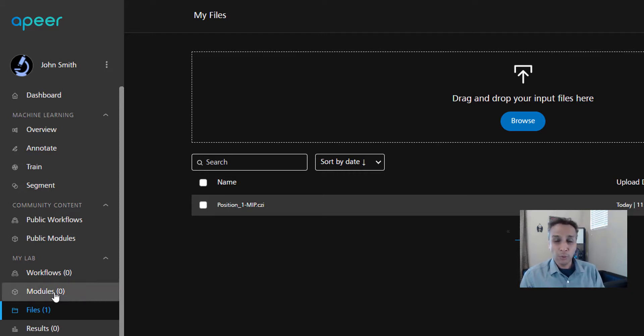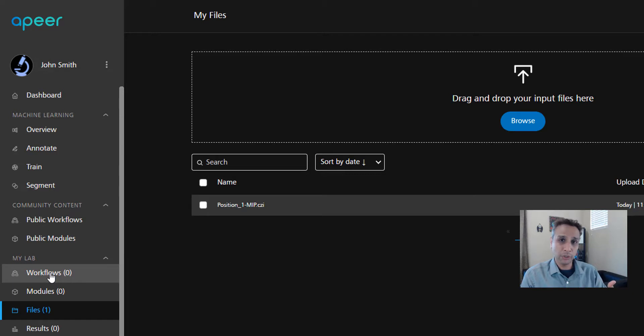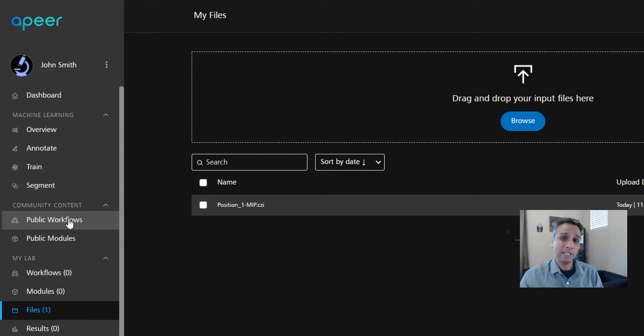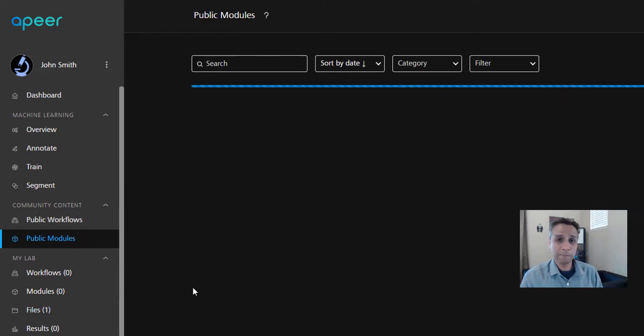I have already uploaded this one image that we're going to use as input for today's workflow. Uploading is straightforward: just go to browse and select the file from your local directory, or drag them here. If you know how to code, you can write your own modules. Otherwise, you can create your own workflows by combining a few modules together.